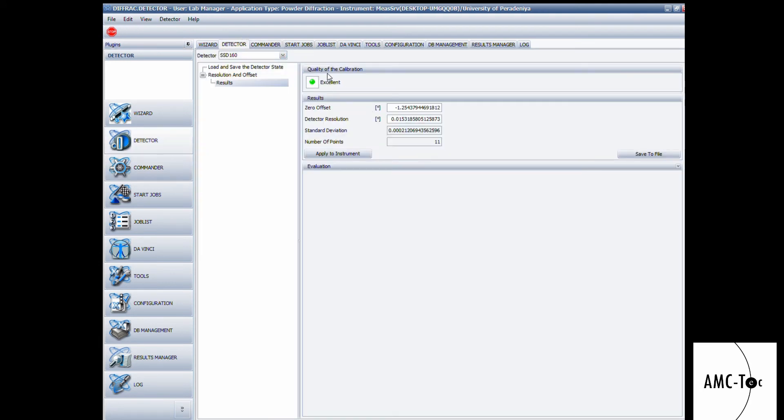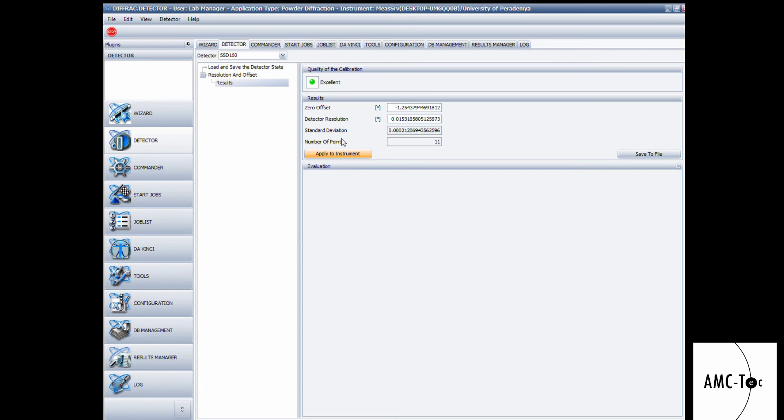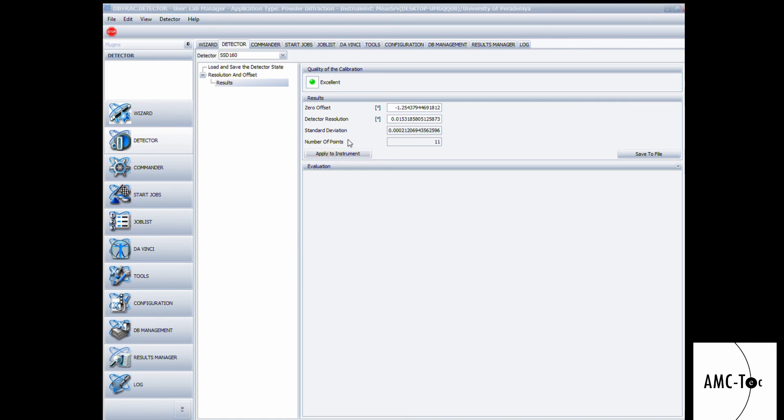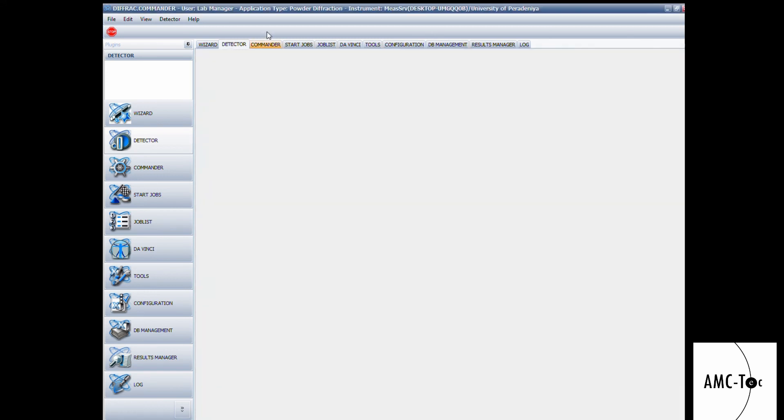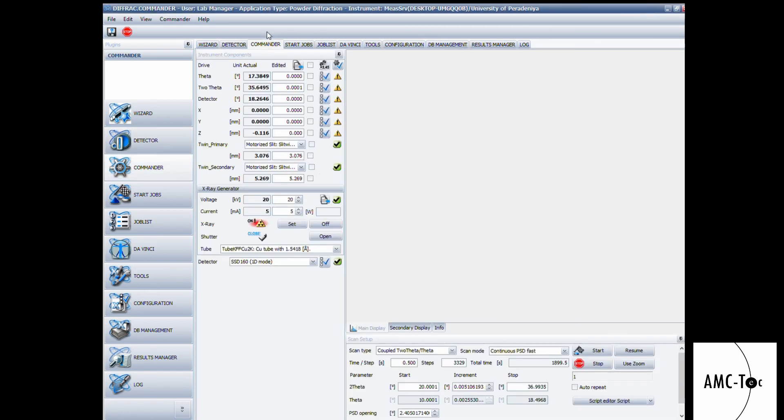The calibration is finished. Now we can check the status of the calibration. It's excellent. Now we can apply the settings to the instrument, so we can click apply to instrument. Now the machine is ready for powder diffraction.